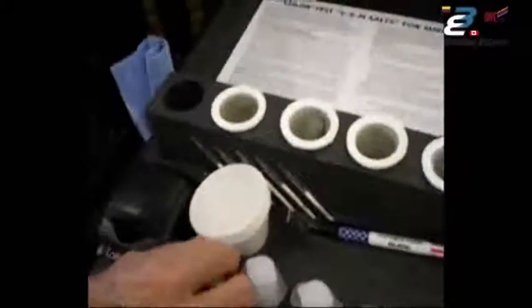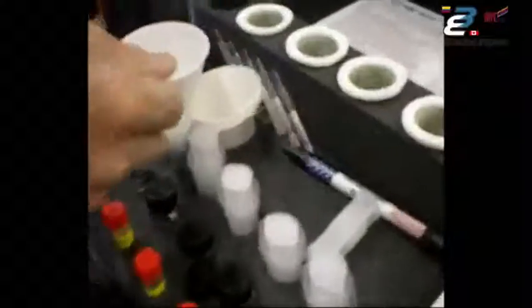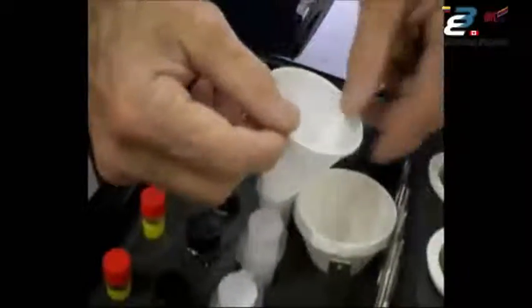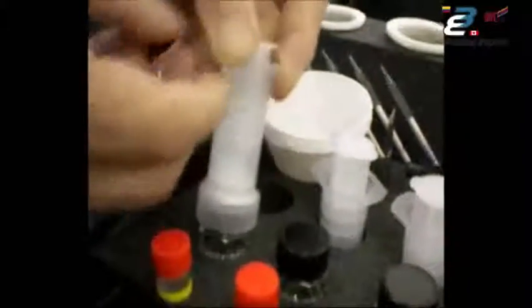After you remove the sleeve, use the autovial, which is the filter component. Remove the top, place the funnel in, and pour the extract into the autovial. These are all one-time use components — use them once and throw them away. The extract will not run through this very fine filter by itself; it takes pressure. Put the plunger in and squirt it right back into the bottle you removed it from. We now have the extract back in the clean bottle, ready to measure chlorides, sulfates, and nitrates.